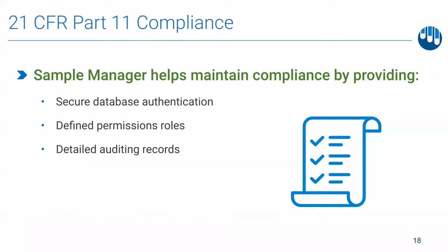LabKey Sample Manager has been built for labs operating in 21 CFR Part 11 compliant environments with password protected login, defined permissions roles, and detailed auditing of records. It's easy to track what was performed when by each team member. By using Sample Manager in conjunction with good laboratory practices, it will be easy to track and maintain good records in the case of an audit.